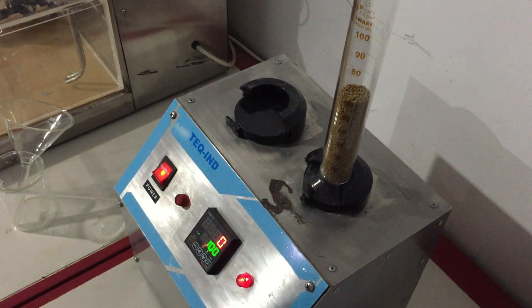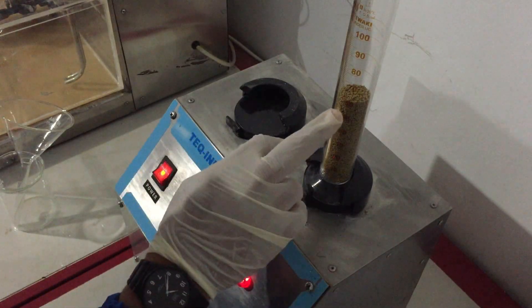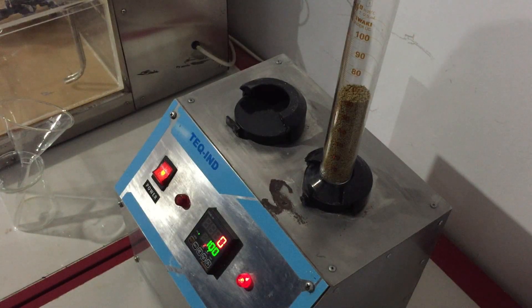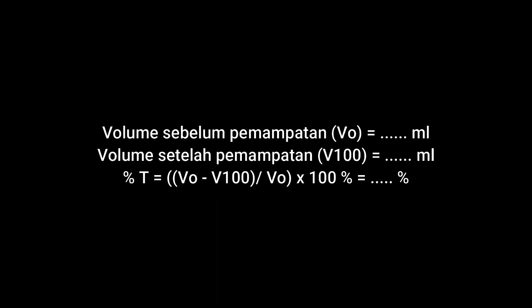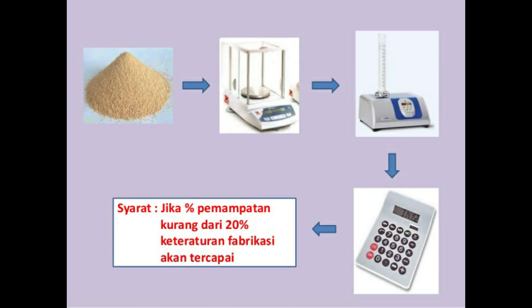Ketika sudah dicatat sebagai volume awal 68, kita nyalakan alatnya. Kemudian kita tunggu sampai volume stabil. Setelah waktunya habis dan sudah disetting, kita lihat disini menjadi 63 untuk volume berikutnya setelah dilakukan uji. Dicatat. (Once the initial volume of 68 is recorded, we turn on the device and wait until the volume stabilizes. After the set time, the final volume is observed to be 63 ml, which is then recorded.)